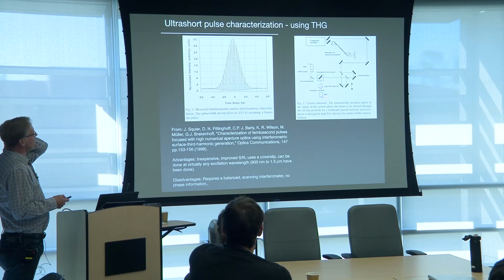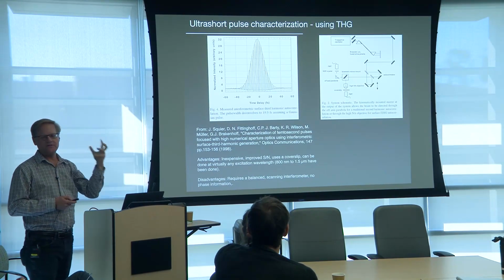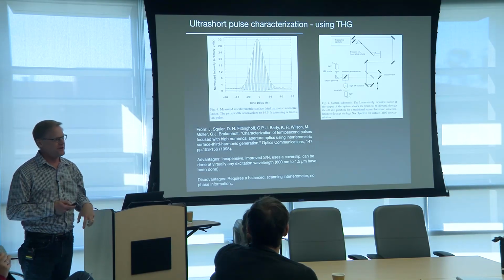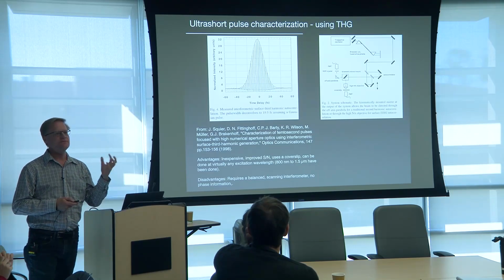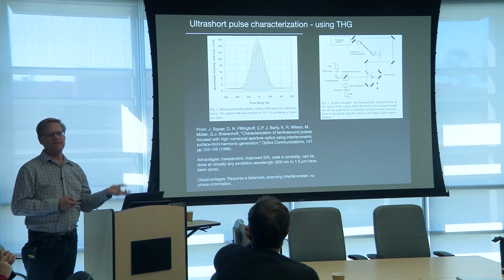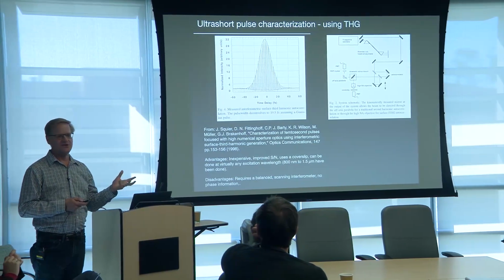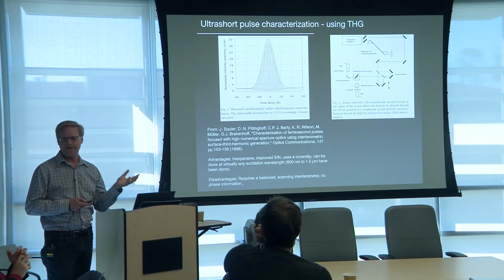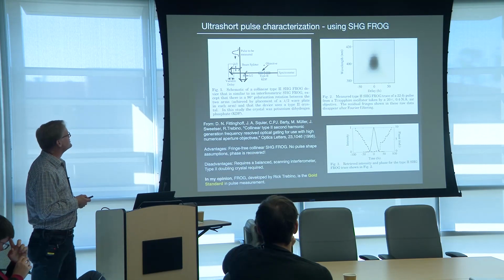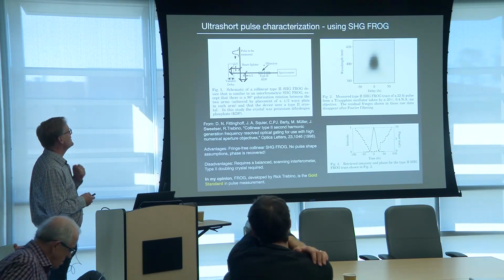What we did at first is we put a doubling crystal here, and we could do second harmonic interferometric images, and then we spectrally resolved that. So we ended up with spectrally resolved autocorrelations, interferometrically, that in principle have the phase encoded. In practice they're great artwork, but they're so complex and data intensive that they weren't really practical. So we collaborated with Rick Trebino, and he came up with a simple solution for us.